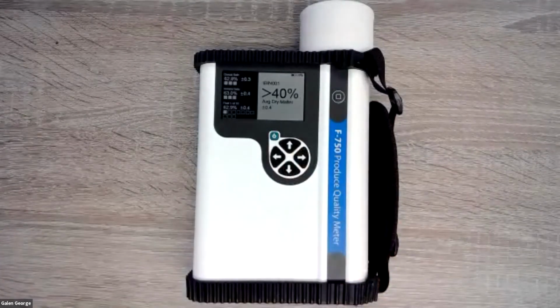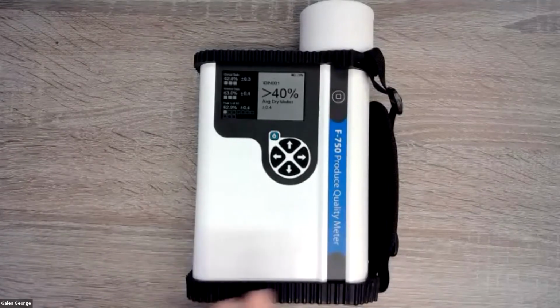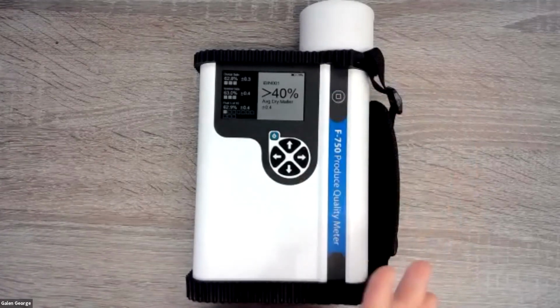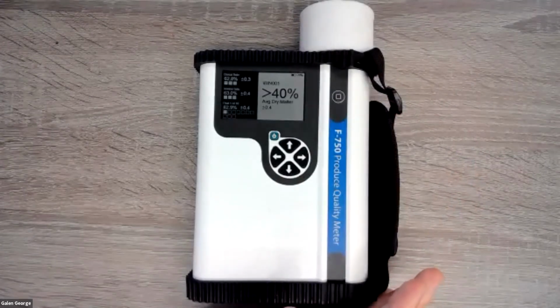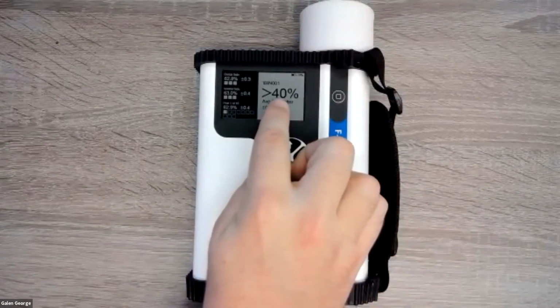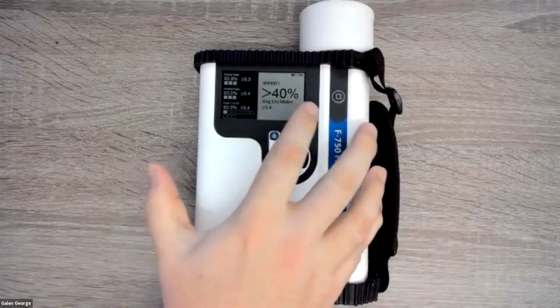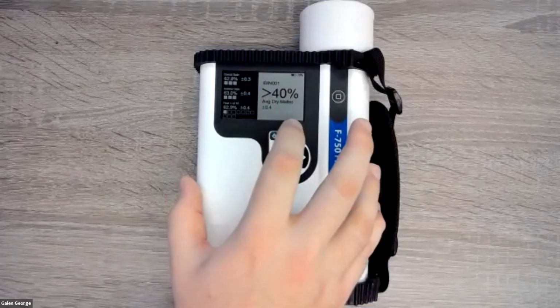I've already pre-taken some measurements to save us some time here. So this is what the screen would look like after taking some measurements. There's a lot of data now on the screen that's available for users to get more insights. The number one thing you'll see is that this large number is representative of the average dry matter of this entire bin.